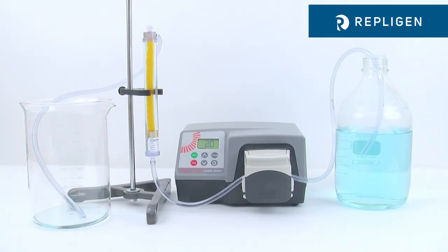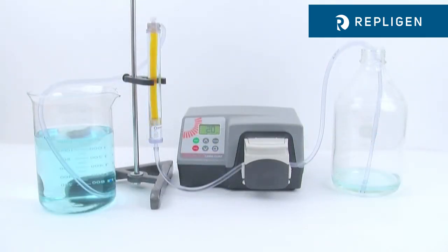Instead of dialyzing for one to two days using traditional static dialysis, the Tubalizer dialyzes in just four to eight hours.